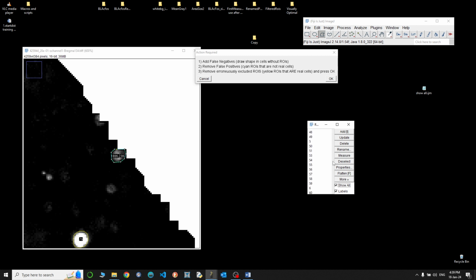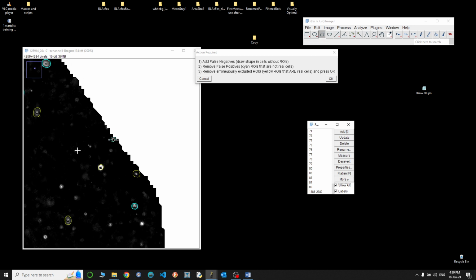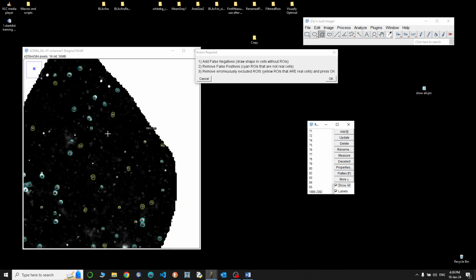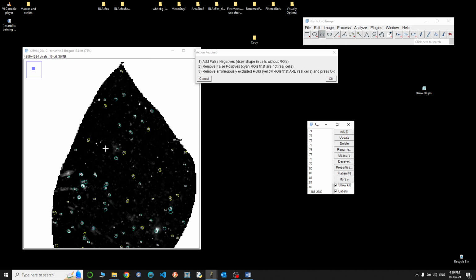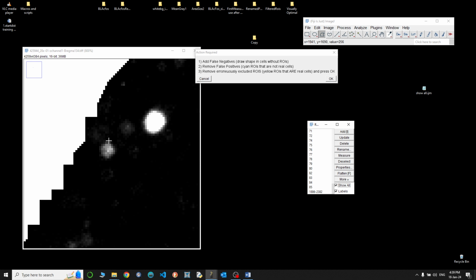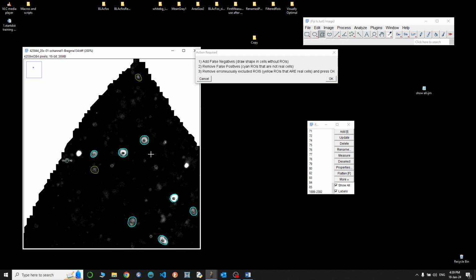And now you see the benefit of having renamed our regions of interest before, because we can easily tell the difference between something that's added by us and something that's added by the program itself, the StarDist network. All right, so you will do that for every neuron that's missed. And the more robust your network is, the fewer neurons will be missed across images, maybe no neurons. By neurons, I mean, well, whatever, objects, right?